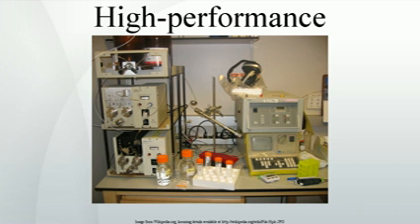In general, ion exchangers favor the binding of ions of higher charge and smaller radius. An increase in counter-ion concentration, with respect to the functional groups in resins, reduces the retention time. A decrease in pH reduces the retention time in cation exchange, while an increase in pH reduces the retention time in anion exchange. By lowering the pH of the solvent in a cation exchange column, for instance, more hydrogen ions are available to compete for positions on the anionic stationary phase, thereby eluting weakly bound cations.